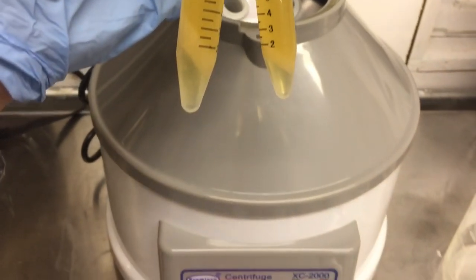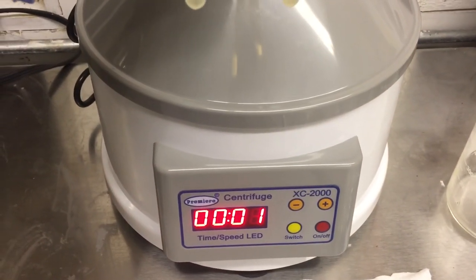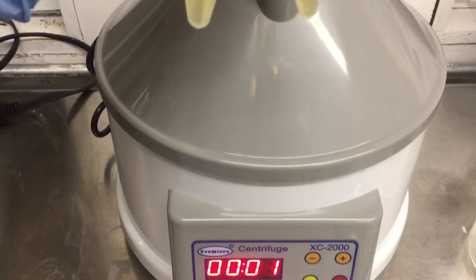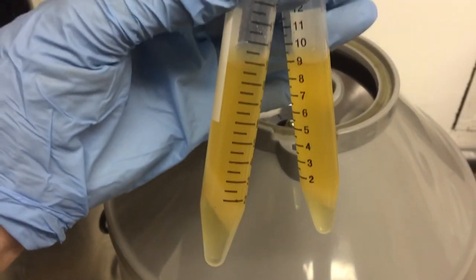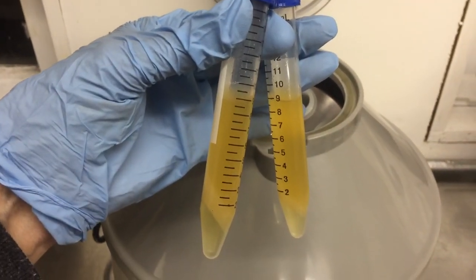I really like my centrifuge — it's very simple. It has a speed gauge and a timer, and that's all you need. Really simple lab equipment to get those kind of results.